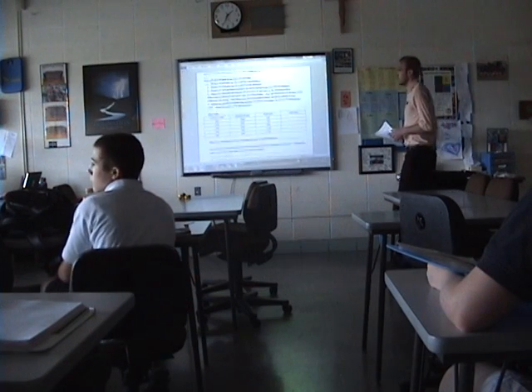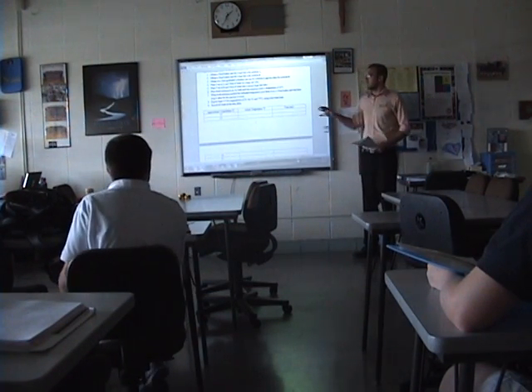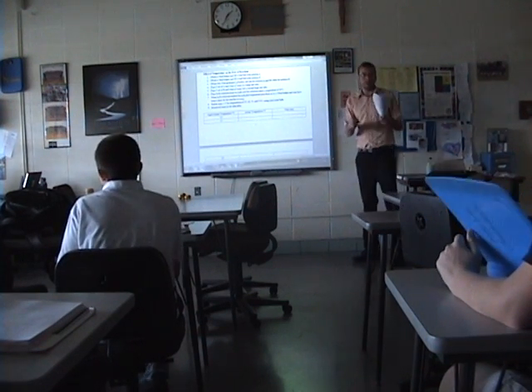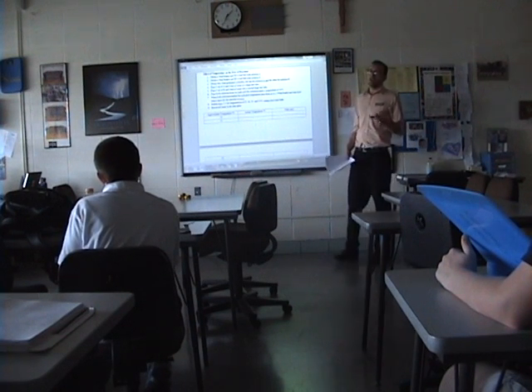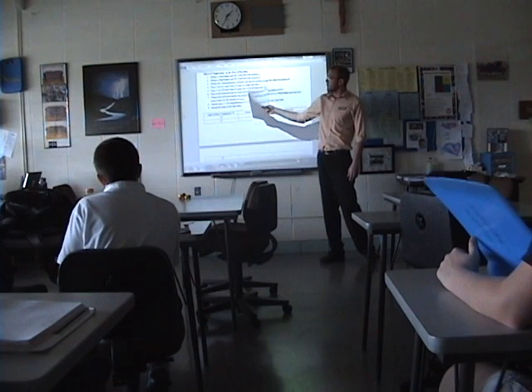All right, so for the second experiment, we're going to be looking at the temperature. Same thing, steps 1 through 3. You get your stock solution. You have the 2 10 milliliter graduated cylinders that you can measure it in. And then you have the same concentration, the same amount of solution A and B. So you're going to have 5 mLs of A and B with the 10 mLs of water.